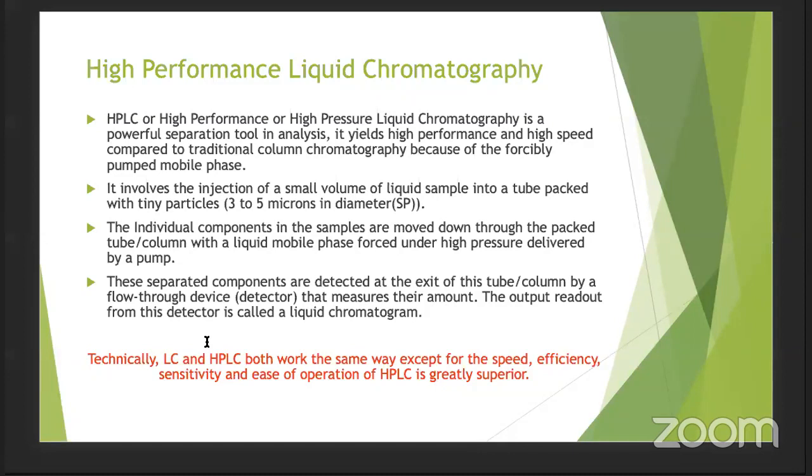HPLC is also called high performance liquid chromatography. Why? Because the resolution power of HPLC is very high. What do we mean by resolution power? Resolution power means the ability to distinguish between two components.